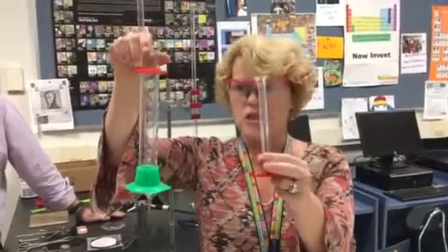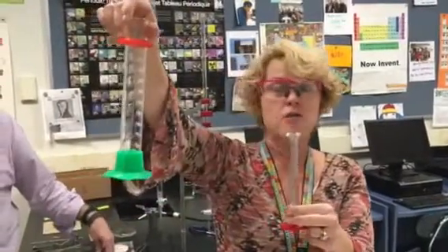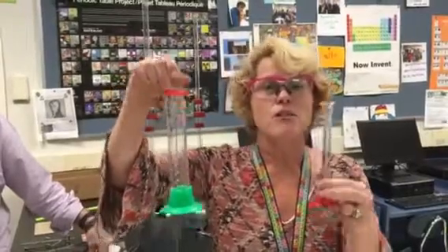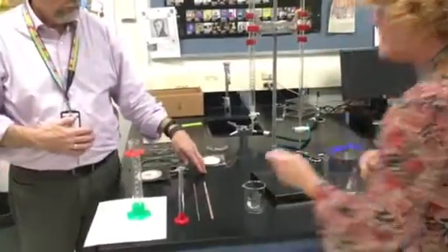Okay, and also remember, think about the diameter. The thinner the diameter, the more precise the instrument, okay? The more graduation. So look at the diameter of the 10 milliliter graduate compared to the 100 milliliter graduate. And you'll start to use these instruments more, so they'll become second nature to you, okay? So let's keep going. Let's look at pipettes.